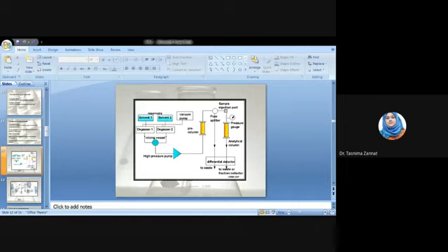The continuous flow of the mobile phase is to be ensured in the system. Analytical column এ continuous mobile phase এর flowটা ensure করতে হয়, and to maintain the flow uniform, here the pump is used, and the pump can deliver the mobile phase in a fixed flow rate. It means per minute, per second, or per hour.